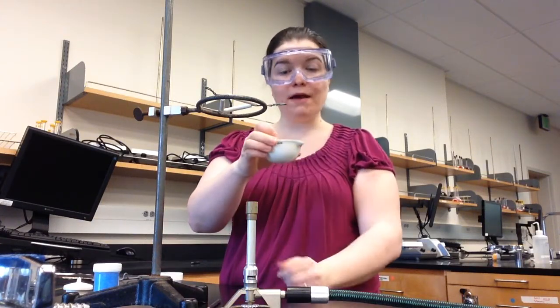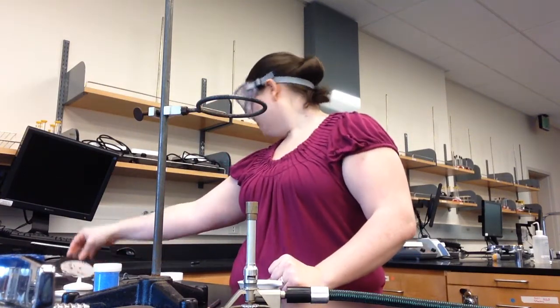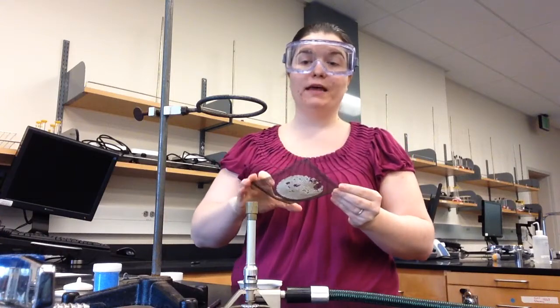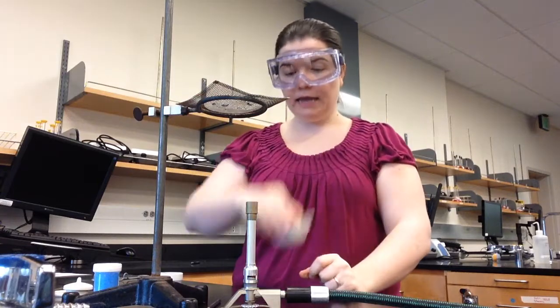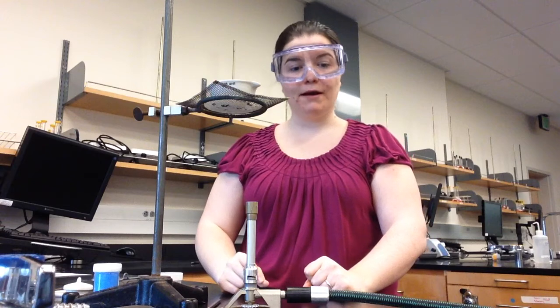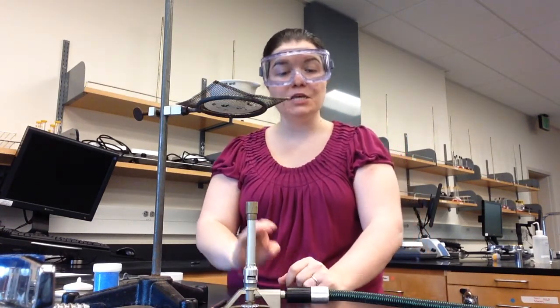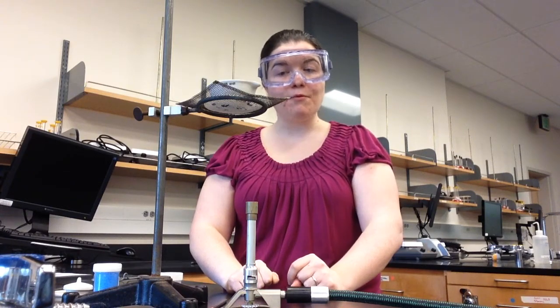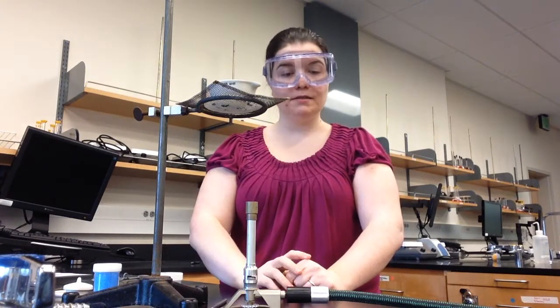We will not be heating the evaporating dish on a clay triangle. Instead, we will be using a wire gauze. The wire gauzes can be found in the drawers on the side of your lab bench. You'll put the wire gauze on top of the ring clamp and the evaporating dish full of blue chemical on top of the wire gauze. You should heat gently for 5 to 10 minutes until a uniform color appears. You should then cool the evaporating dish and measure its mass. You can cool the evaporating dish right here on top of the wire gauze.